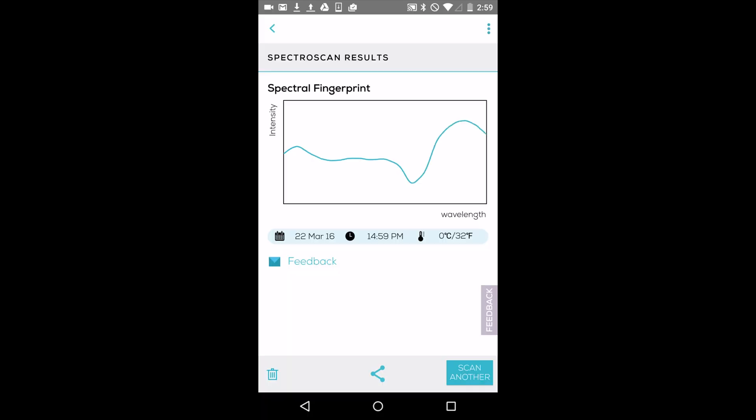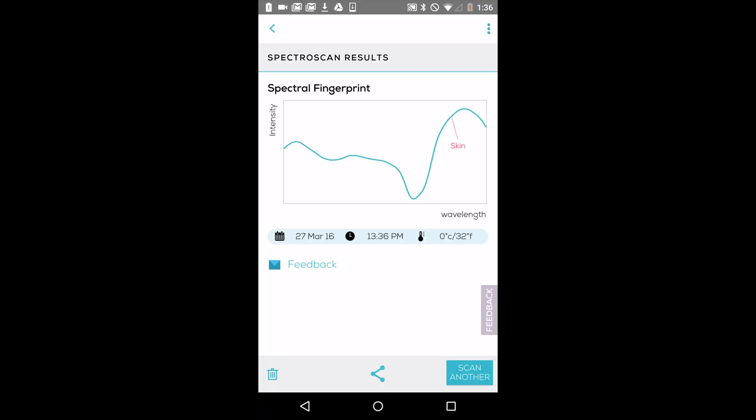As I mentioned, we're adding more applets periodically, so you can expect to see an increasing list of SCiO applets in your app. The last thing I'd like to show you is Spectroscan, which lets you scan absolutely anything and get back the unique molecular fingerprint — the spectrum of that object. With it, you can compare molecular fingerprints of different materials. For example, did you know that our skin's molecular fingerprint can look very similar to that of cheese? That's because they're both mostly made up of water, protein, and fat.